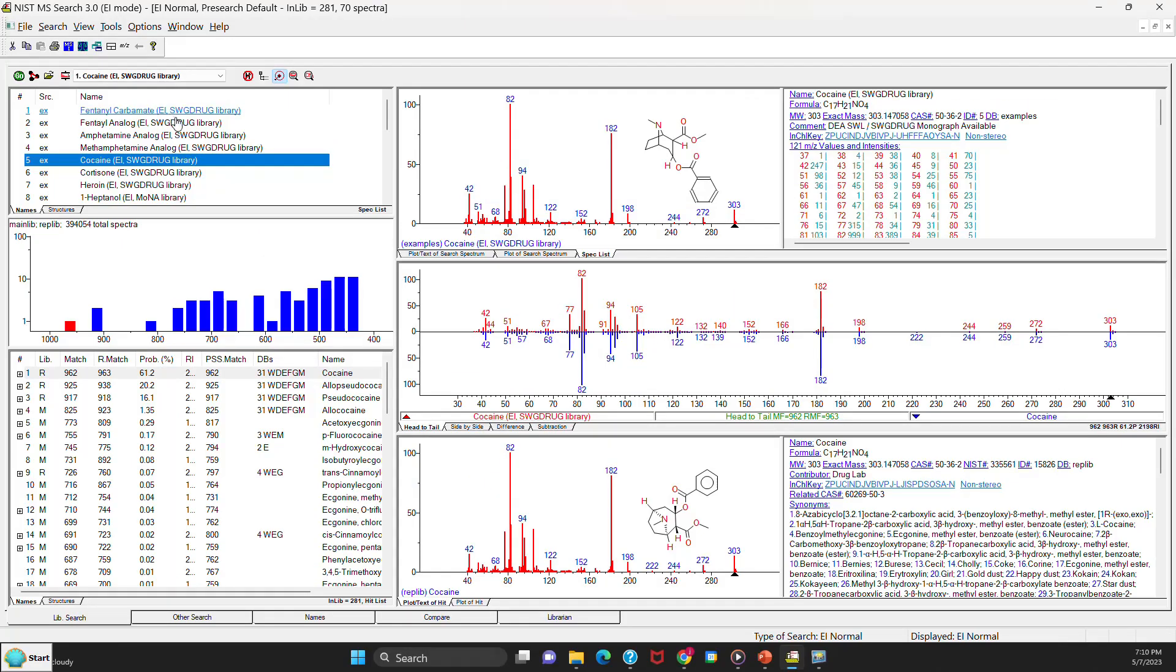Another new feature of the library software is if you go over an ion in a spectrum and you hover it over it, and it's not labeled in the display, it'll show you what the mass to charge value is for that ion.